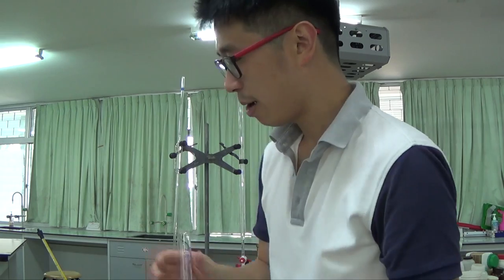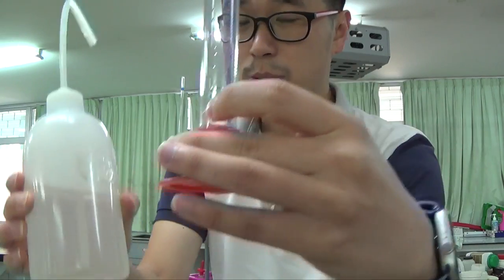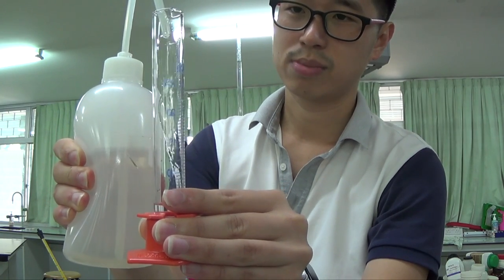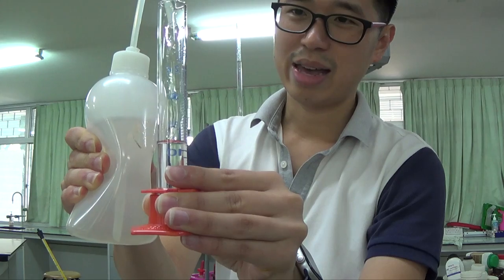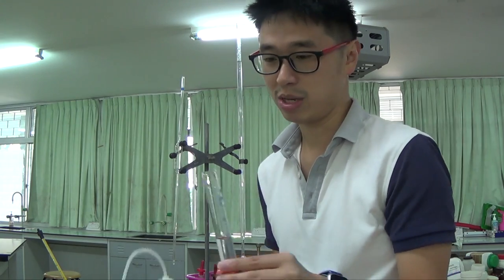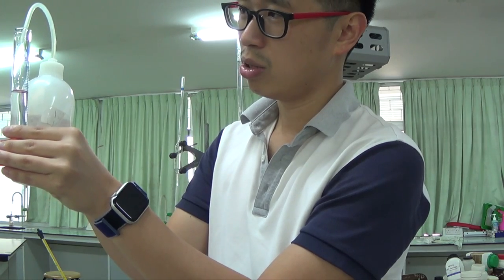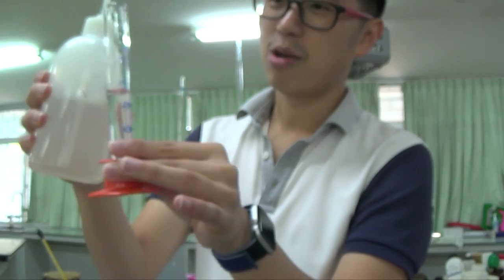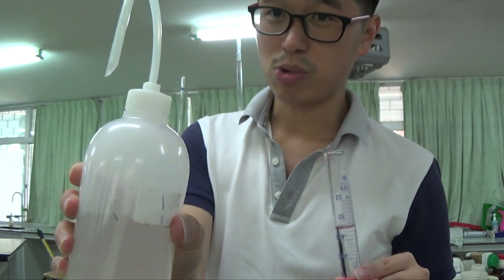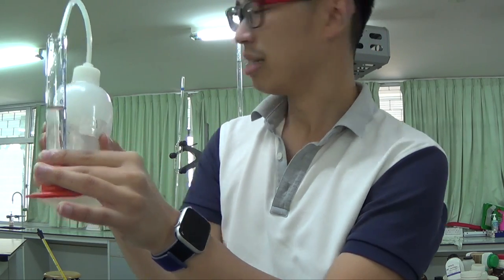I probably won't do this step by step for the other readings because it will be too slow. All I'm showing you is for one. So this is 5.00 cm³. I need to add until it's 25.0 cm³. So add distilled water until about 20, then you need to be careful. You should use a dropper in the end because you want it to be exactly 25.0, so you do not overshoot it. Do not pour straight from the bottle once it is close to 25.00, because it's very easy to over squeeze and then you can't go back, you have to restart again. That's the biggest danger when you do this kind of experiment, I guess.